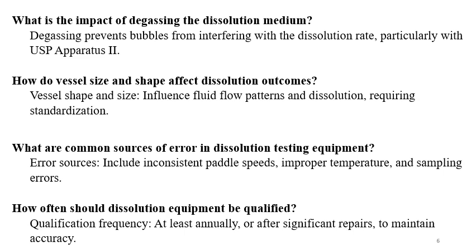What are the common sources of errors in dissolution testing? So sources are inconsistent paddle speeds, improper temperature and sampling errors. Many common errors may be there, like human errors, equipment errors and operating errors.